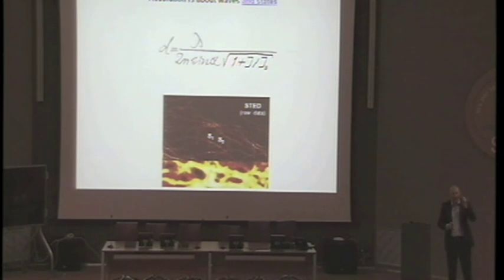It's waves and states. And so the question of the 21st century when it comes to resolution will be not only give me the best lens, the best wave treatment, the best focusing, but which states in the sample give me the best spatial resolution. And this is what future generations will ask. They will see the sample as a part of the image formation. The molecules that they look at are a part of the image formation. And if they can get them in two different states in a short period of time, the diffraction doesn't matter, and you can get the crispest images just by using focused visible light.